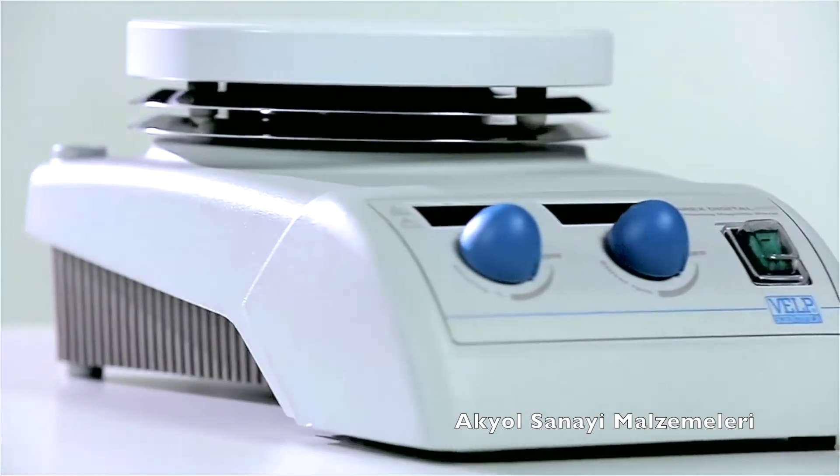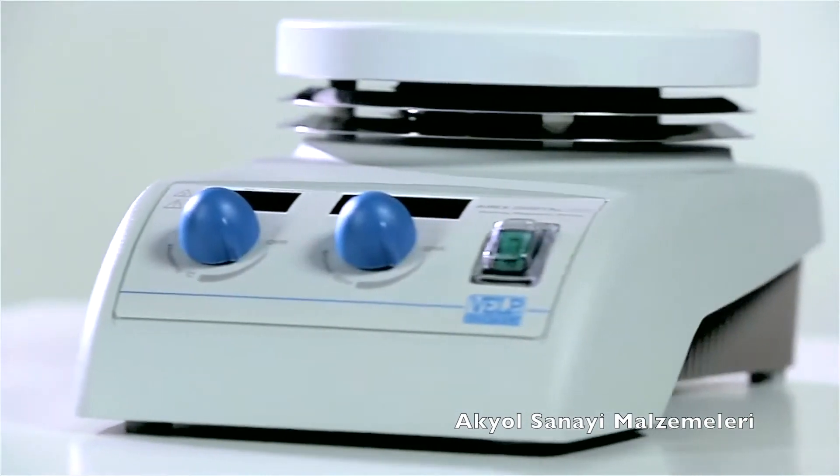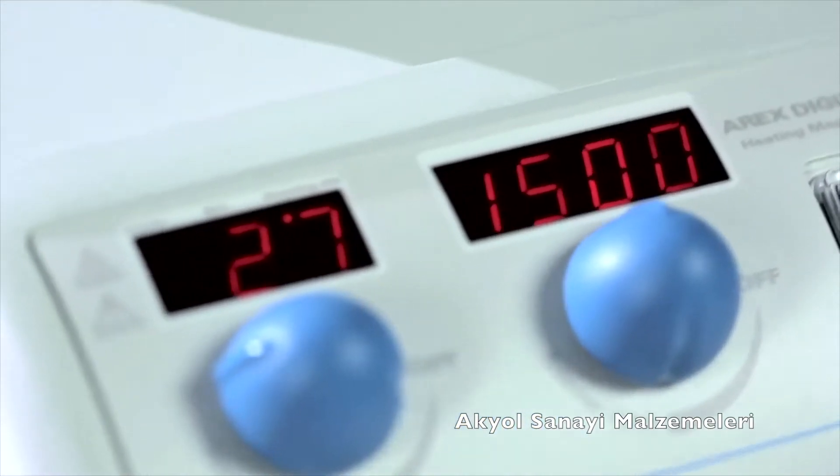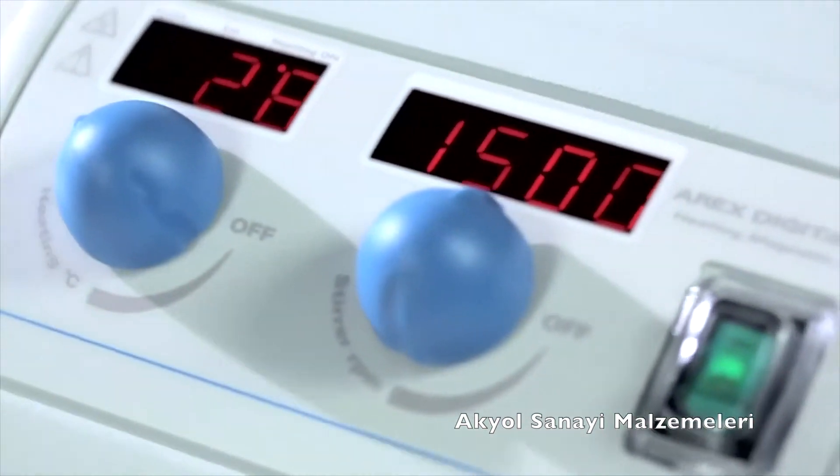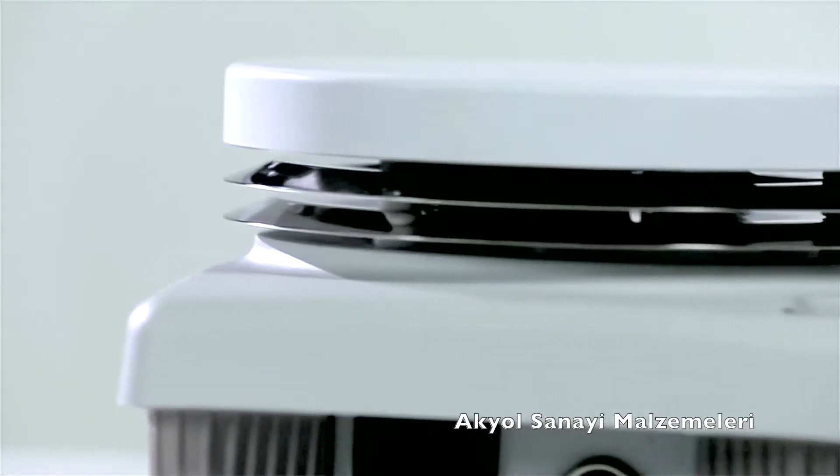The new Aerex Digital Hot Plate Stirrer from VELP Scientifica is built for the very highest level of performance. It is incredibly powerful and remarkably resistant.